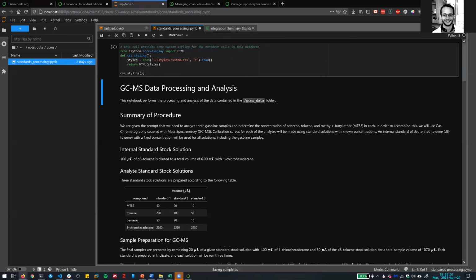Oh, I have chat hidden, 1 second. Okay. So, okay, I guess we're losing people here, but that's fine. Everybody, well, everybody except for Lily, have their environment made and Jupyter Lab open? Or is anybody not at that stage yet?